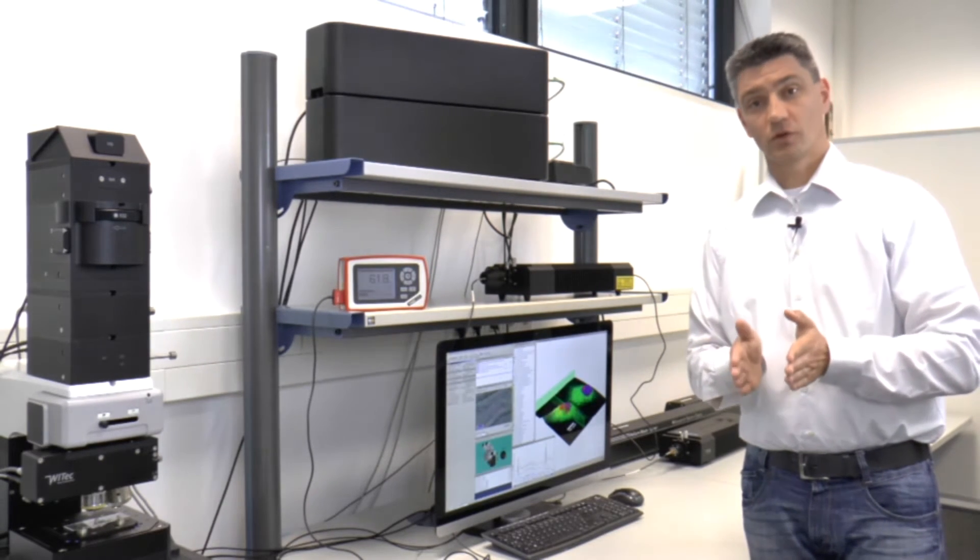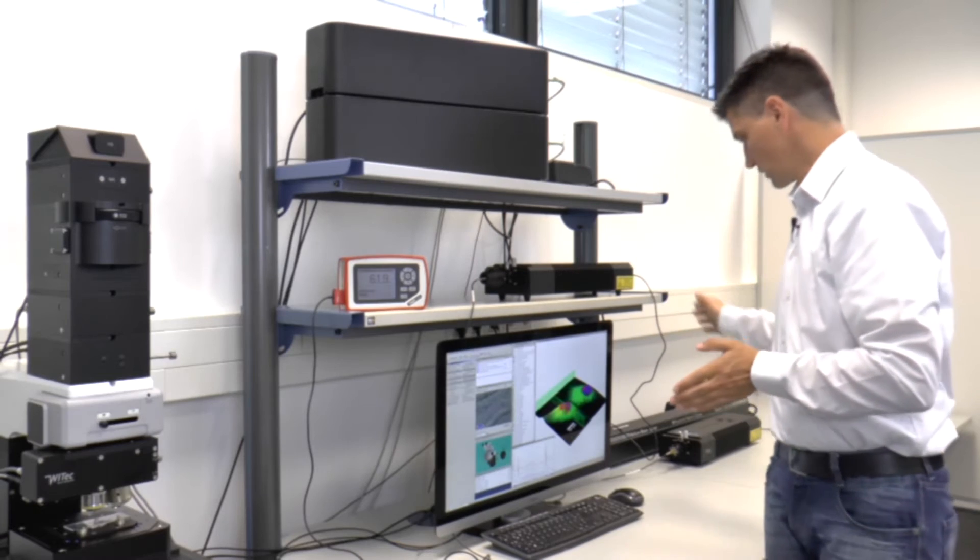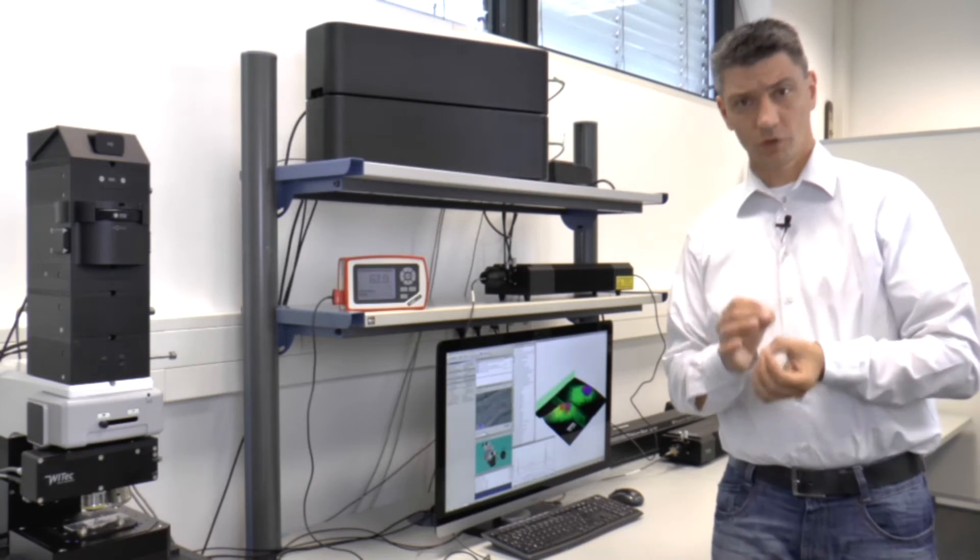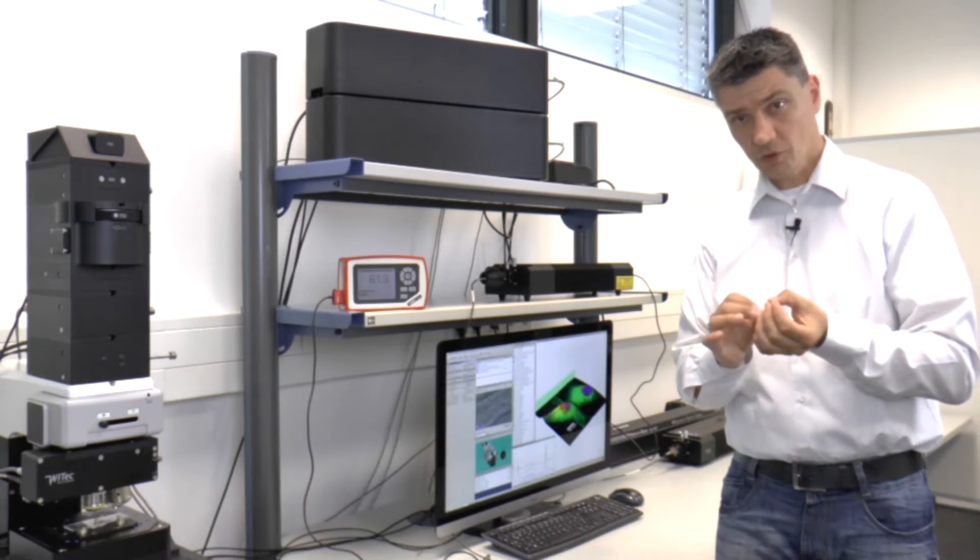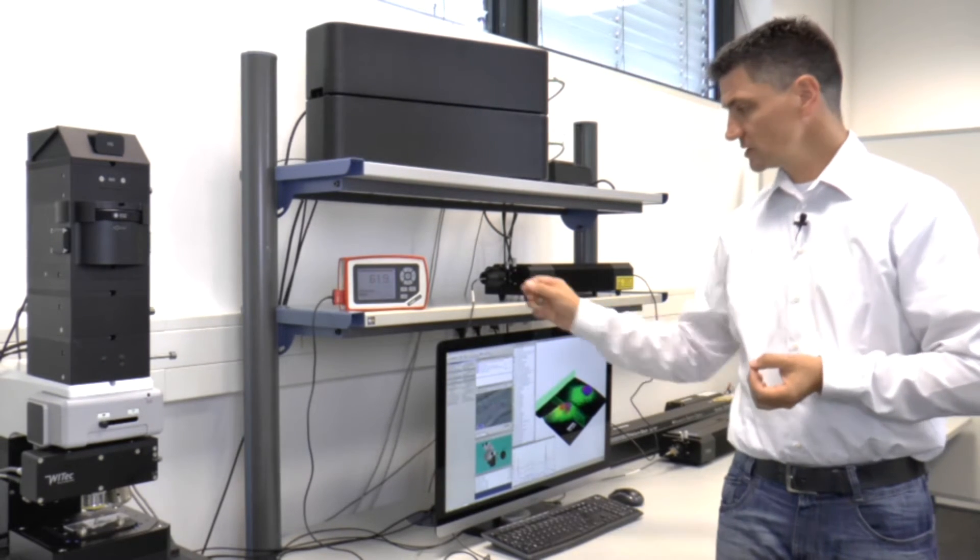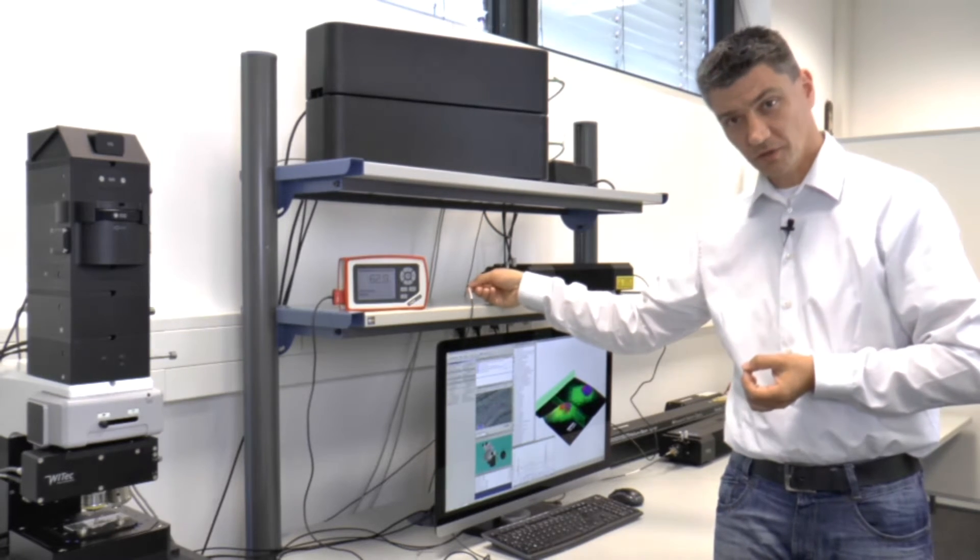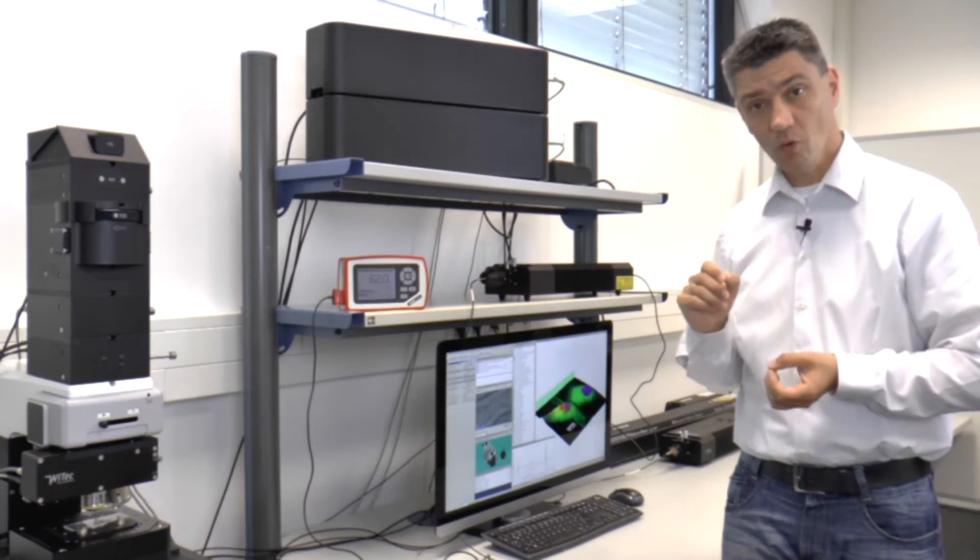The system of course can also be equipped with multiple different lasers as you see over here and these lasers can also be equipped with a true power module. The true power module allows you to measure the laser power right inside the fiber and this you can control using the software and I will quickly demonstrate this by using the software.